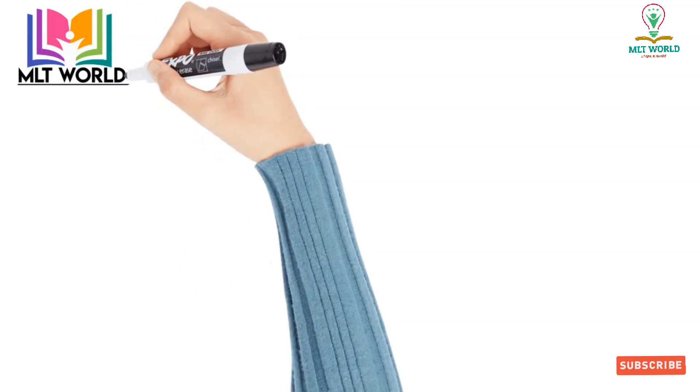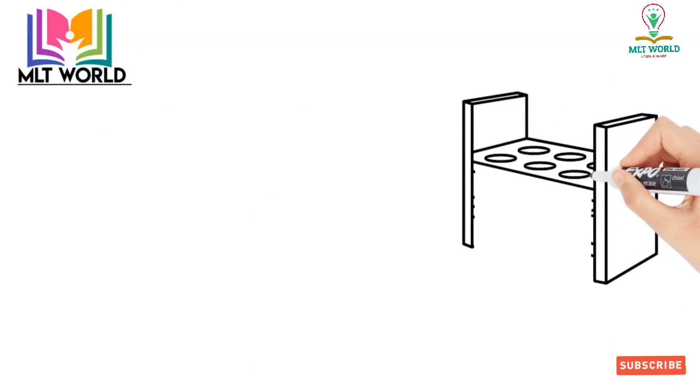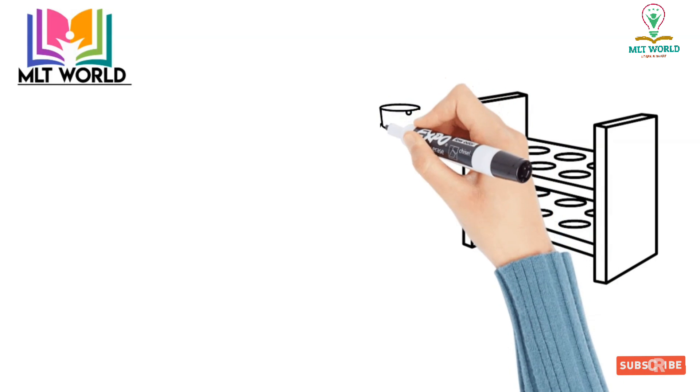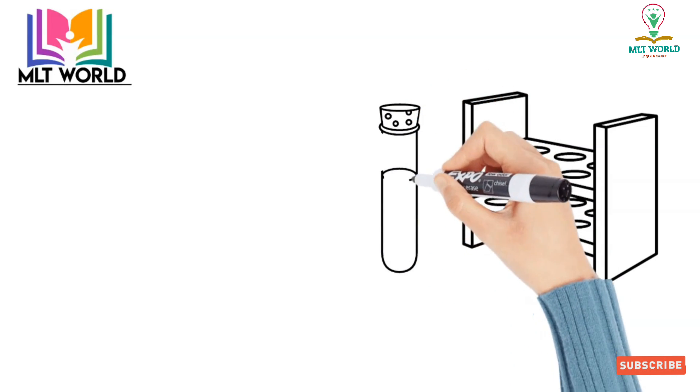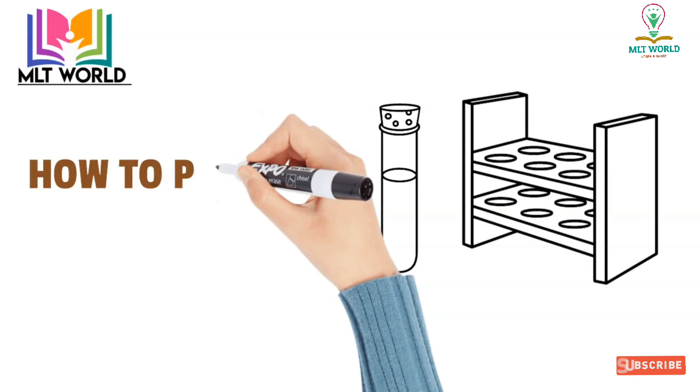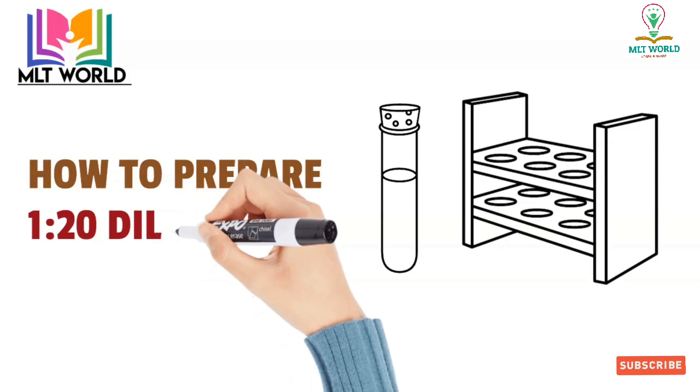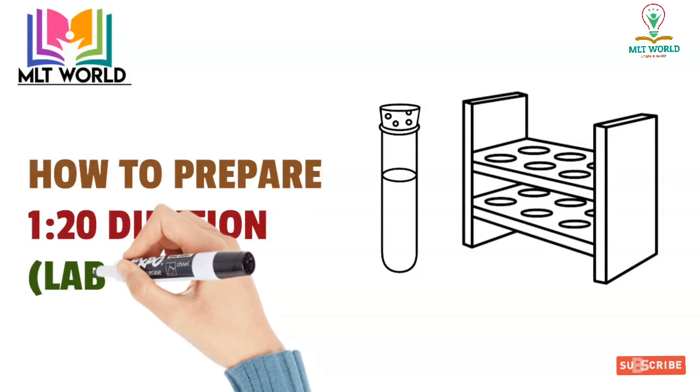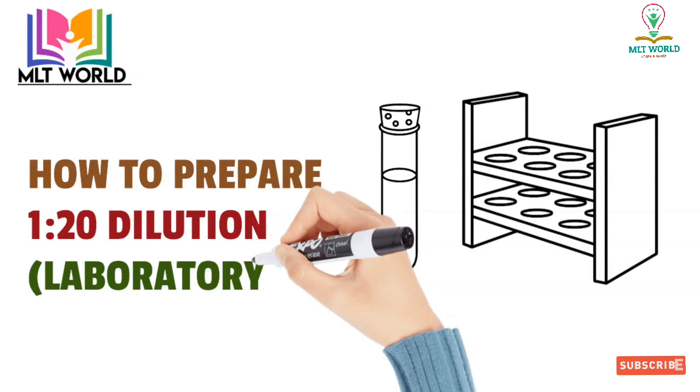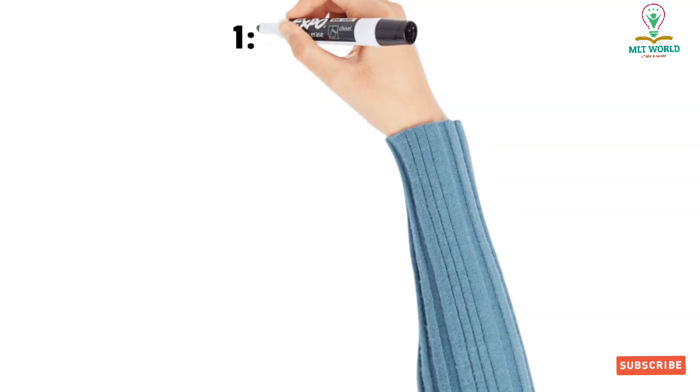Welcome back to MLT World. Today, I will share how to make a dilution, and one of the most common dilutions we use in our routine is 1:20 dilution for WBC making dilution, sperm count dilution, or if any value is coming very high and you have to decrease the sample quantity.